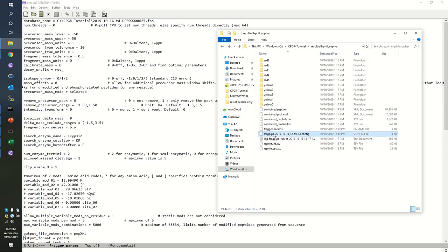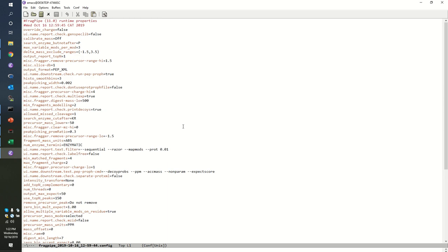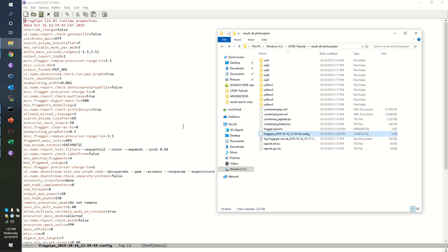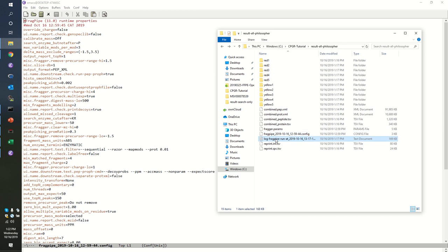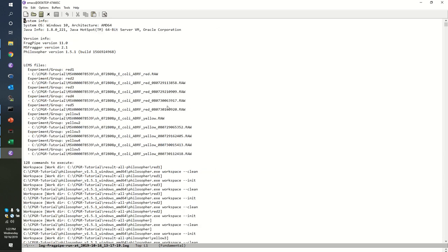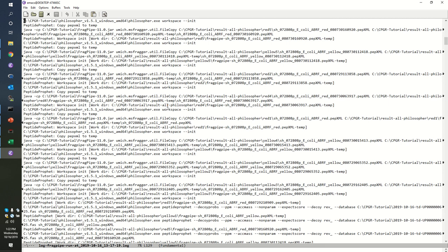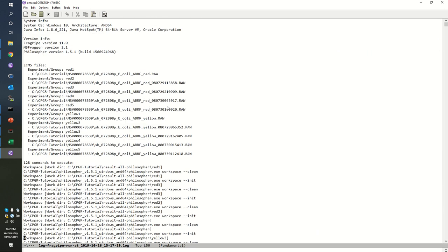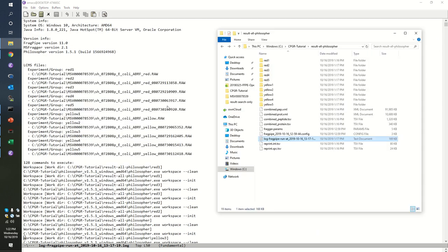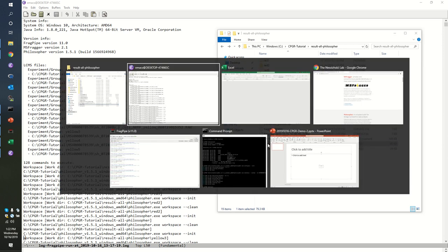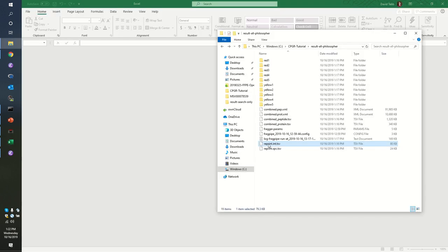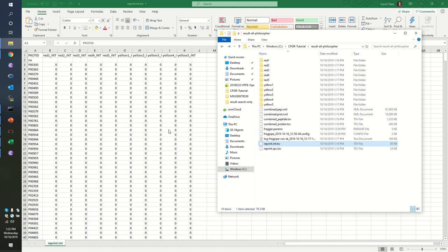We have the FragPipe config itself. This is how the user interface observed what we specified. You might want to go back to look at all of that text that was scrolling by as you ran your search. That's here in the log file. But these little values down here are the ones that are going to be our all-stars.